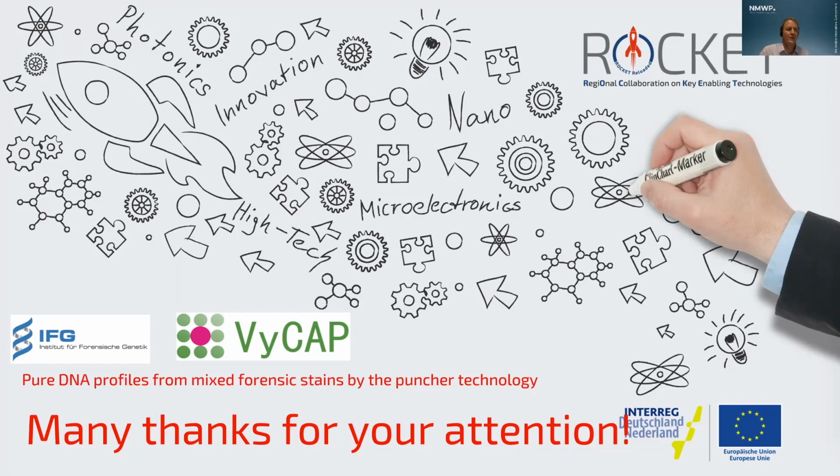Yeah, I think over that, how do you pick them up at the crime scene? With a vacuum cleaner? And if you would think about this, you would have the complete dirt in your probe. So it's even harder to differentiate. So in this case, again, automation would be the key, because you would have a lot of dirt and just some single cells in this.